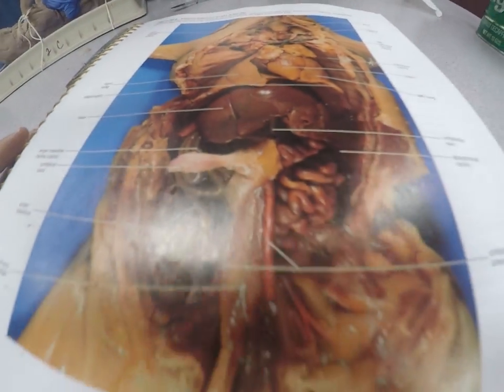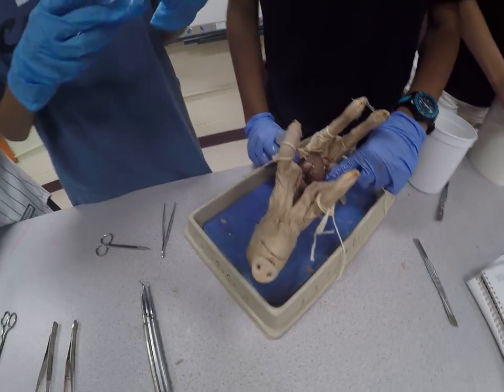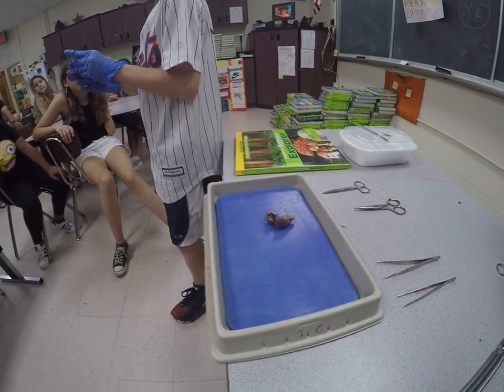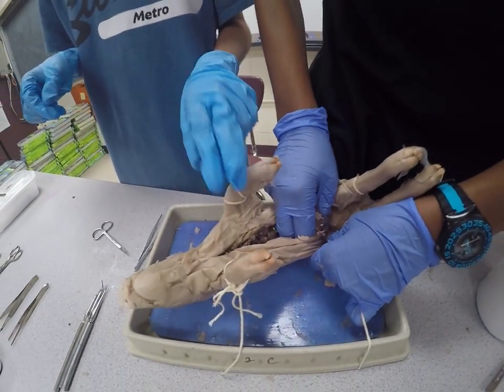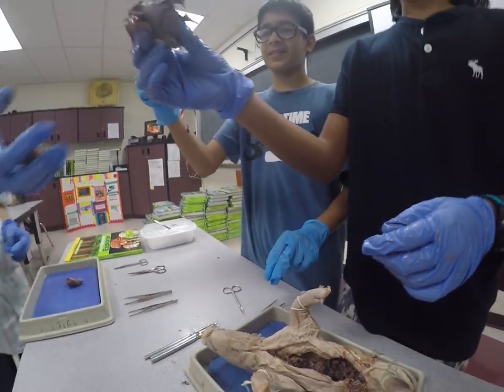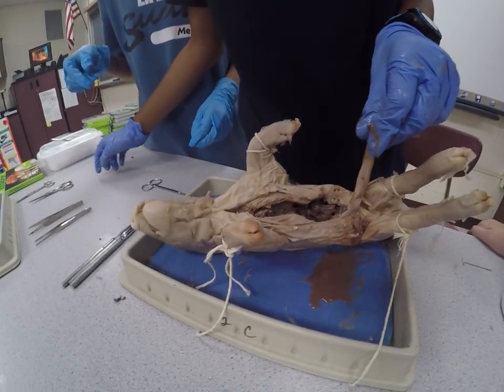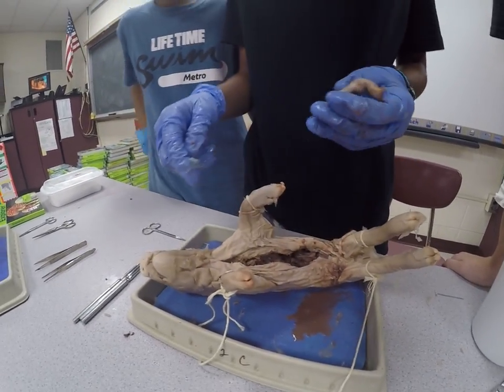We are trying to pull out the liver — the liver is gigantic. We got the liver! We have most of the liver. You can see how dark it is — that's because the blood in the liver was so rich. It's more brownish-reddish because the blood was so rich, as opposed to the inside of the other organ, where the blood didn't have as much oxygen in it, so it was not as rich.